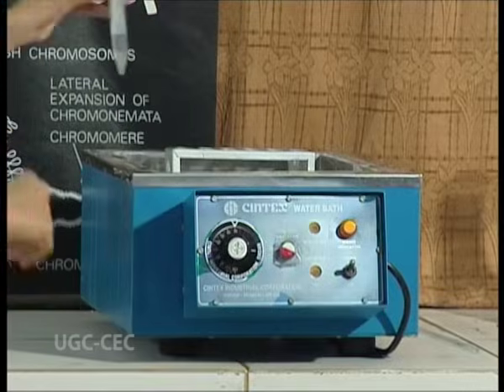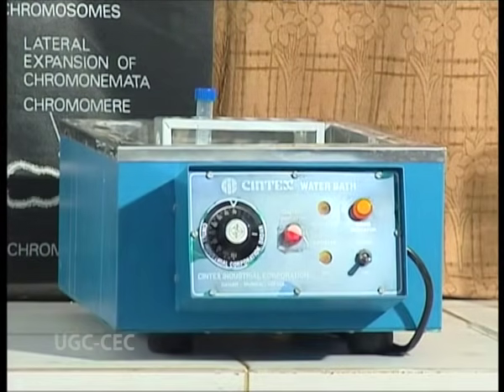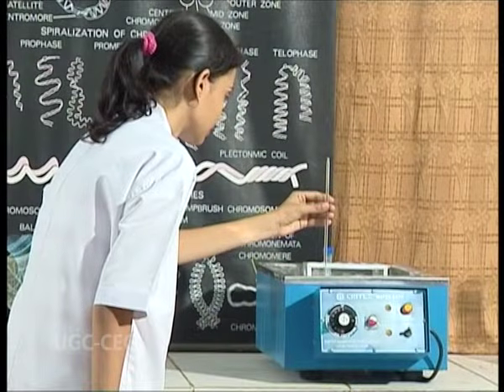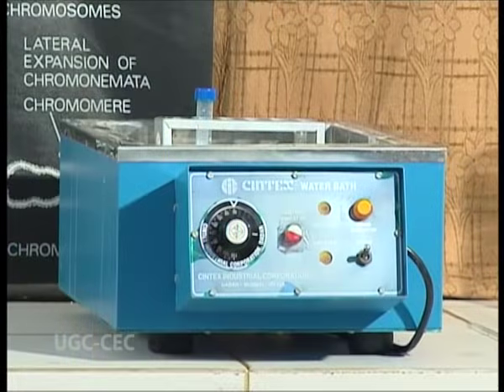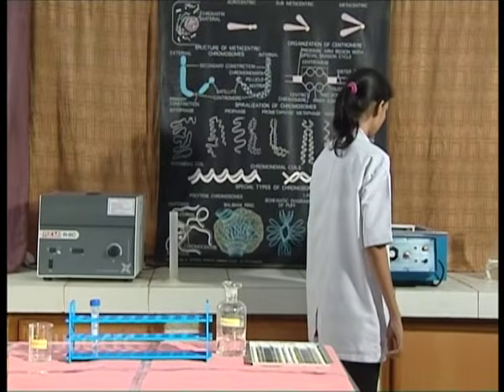Incubate the tube in a water bath for 20 minutes at 37 degrees centigrade. The temperature of the water bath should be maintained at 37 degrees centigrade and hence should be checked periodically.